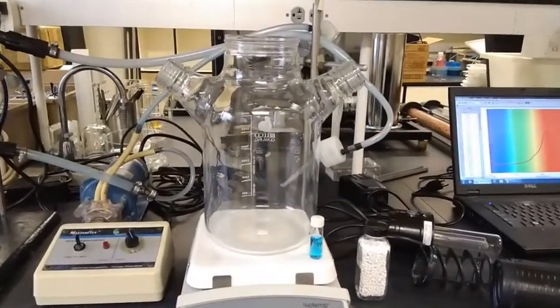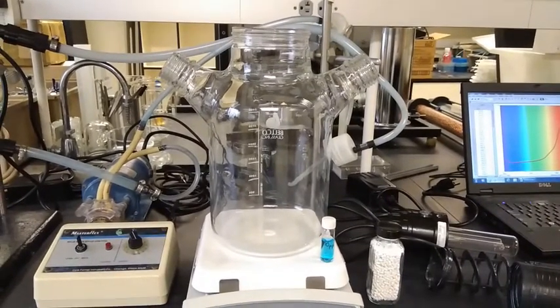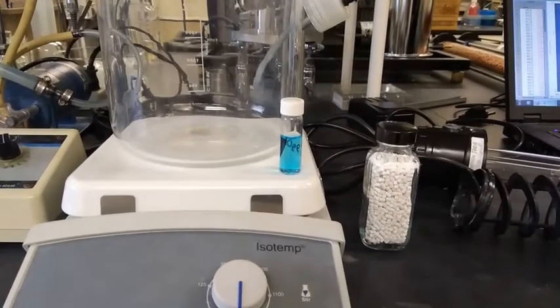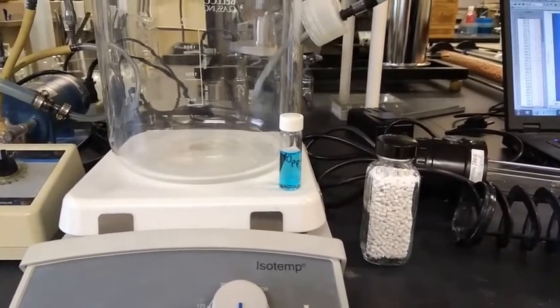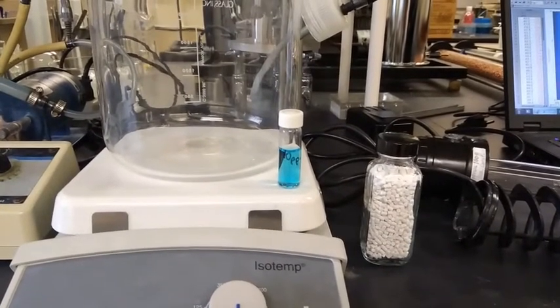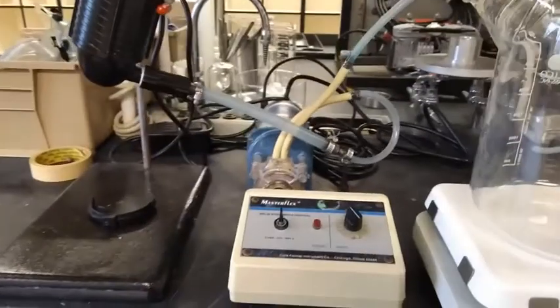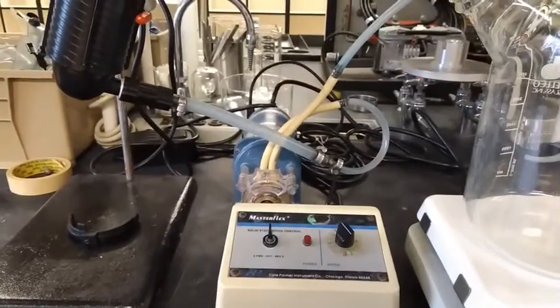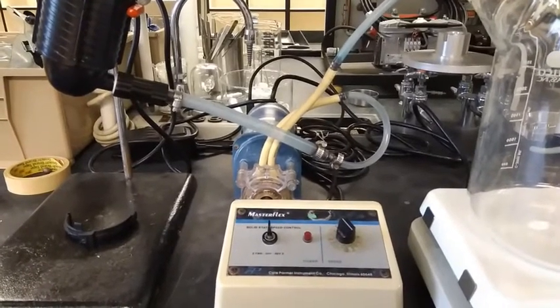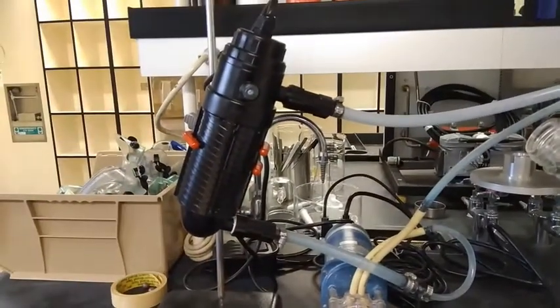This big container here will contain the solution when we conduct the experiment. This small container in the front shows you what that solution looks like — we use a 10 parts per million solution of methylene blue dissolved in water. In the back, there is a pump with the controller in the front, and that pump will pump the solution through our actual reactor.